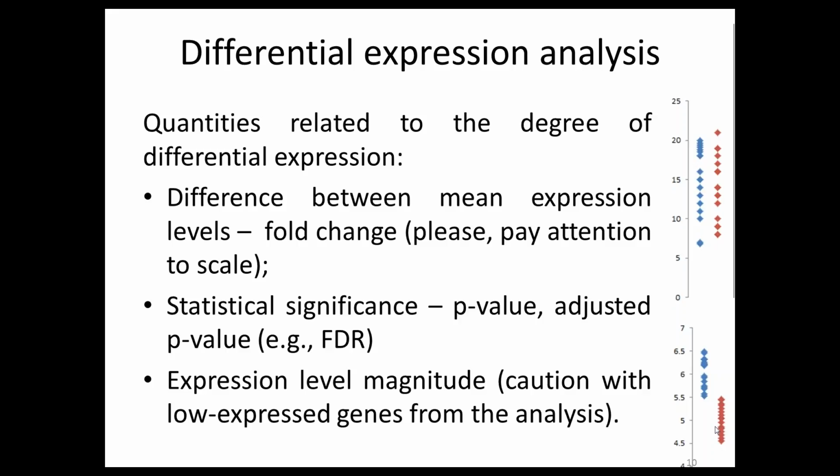So for formalizing these things, there exist several tools aimed at the analysis of variance of these sets, and they all result in one number, the p-value. The p-value is the probability of observing such or higher difference if we assume that there is no difference between the samples.